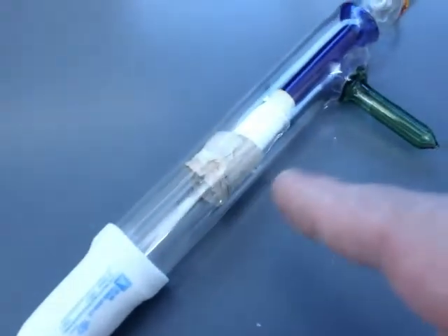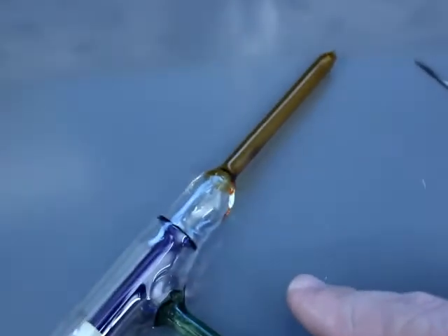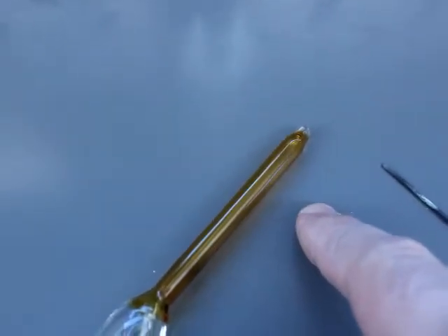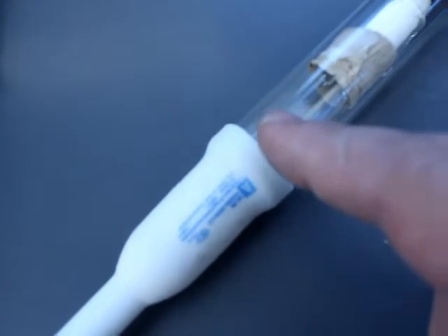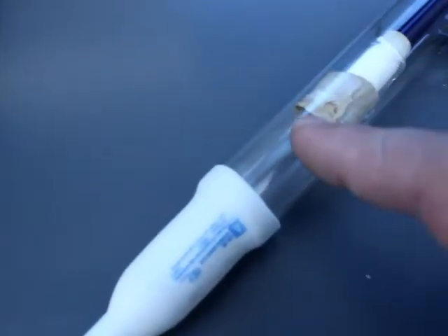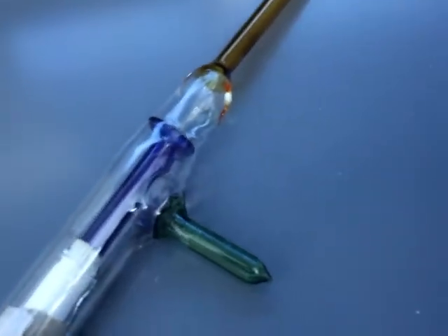I'm going to remove the adapter, and the Kim wipe and paper towel will come off. Then what I need to do is open this tube, put a blow hose here, or I could blow manually, but I'll probably put a blow hose. Then I'm going to seal it off here. I'm basically going to make a round bottom or a test tube. That will complete this part of the body. Then I need to come here, open this, and at that point I'm actually done.